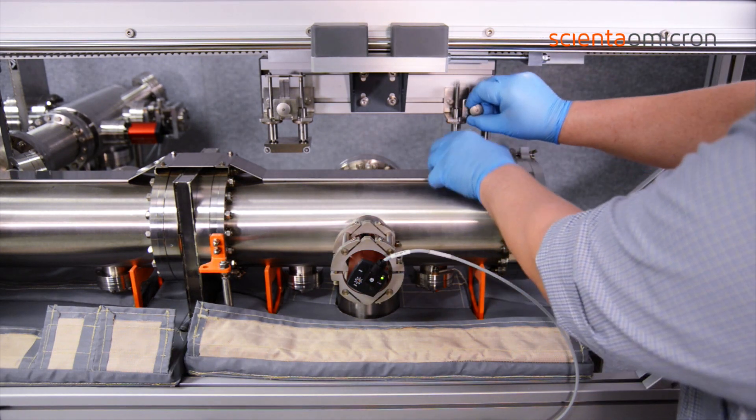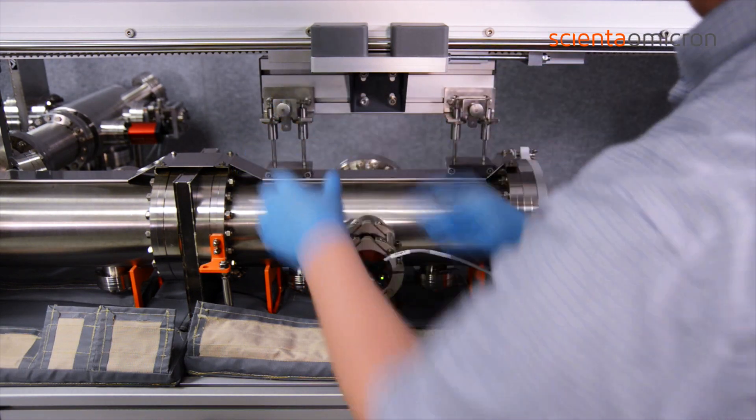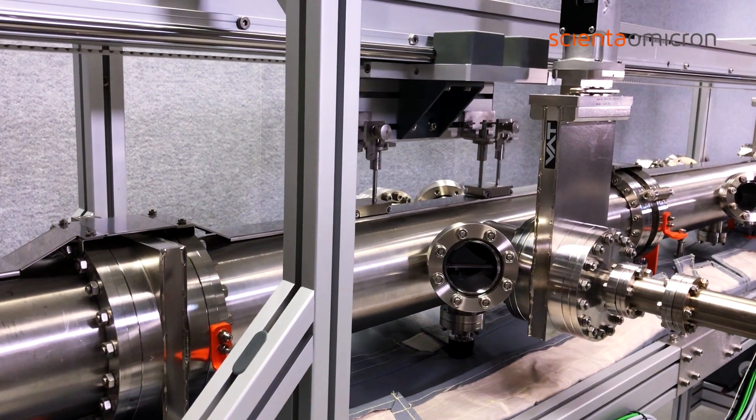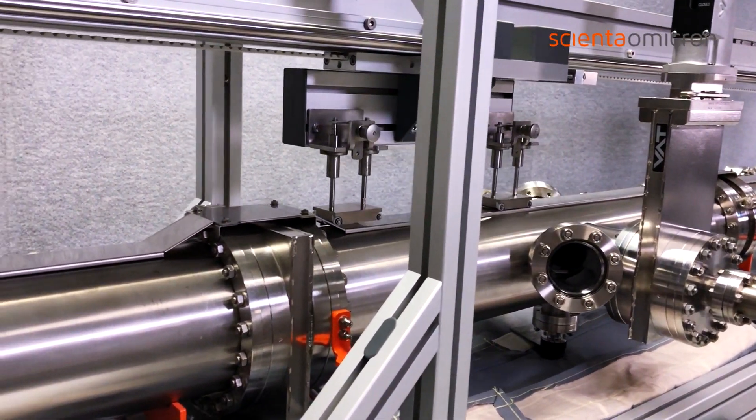A robust magnetic coupling mechanism between the driver and the sample trolley maintains connection as the trolley passes through flange connections and gate valves.